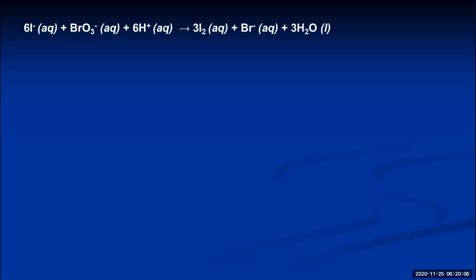So our algebraic expression that shows these two facts, the fact that the rate is proportional to the temperature and the concentration of the reacting molecules or ions, is called a rate law. And this is what we're going to try to determine in part A of the experiment today.